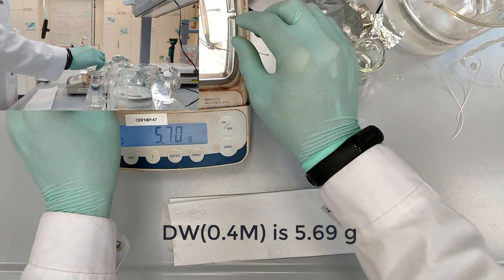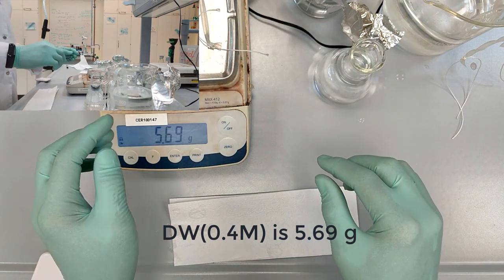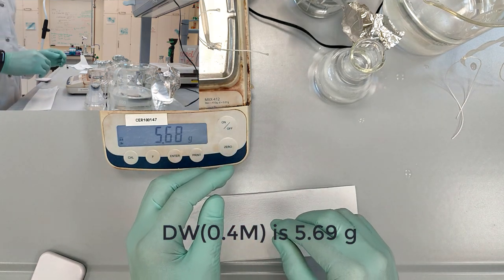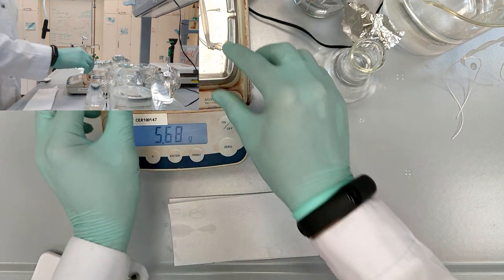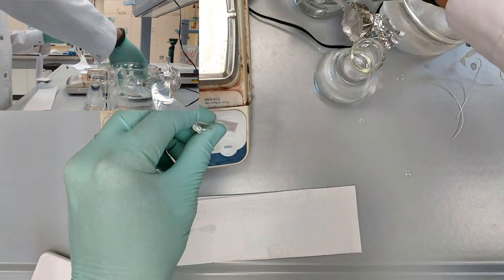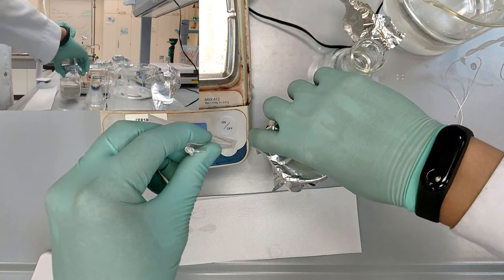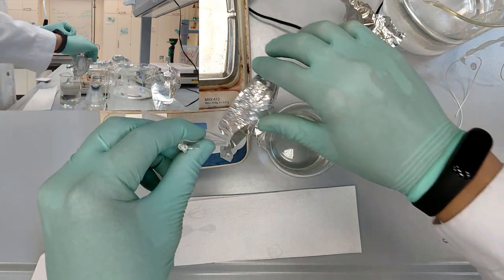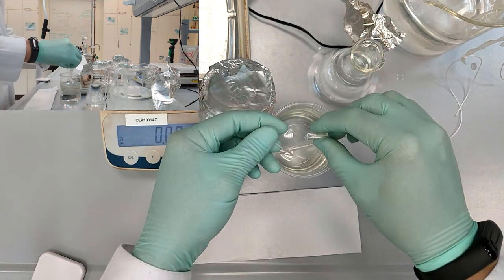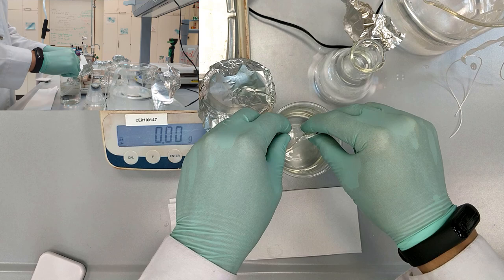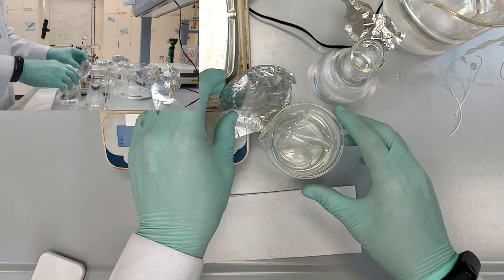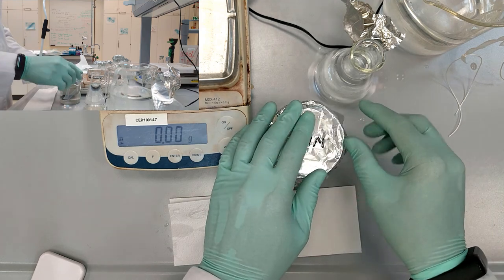The first tube that we are going to put in the 0.4 concentration solution is 5.69 grams. So we take the appropriate solution and try to dip the dialysis tube so that the solution covers it.